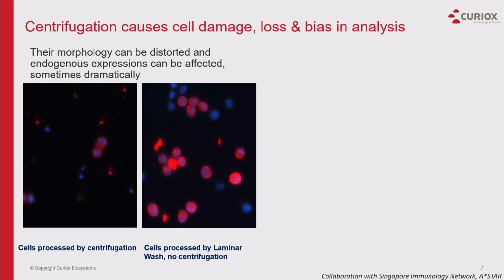So what I want to show you is what centrifugation can actually really do to your cells. It can cause a lot of cell damage, it can cause cell loss, and it can cause a bias in your data.